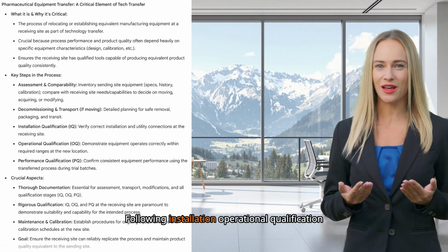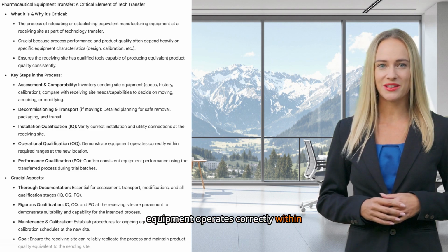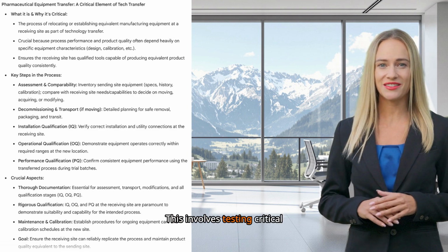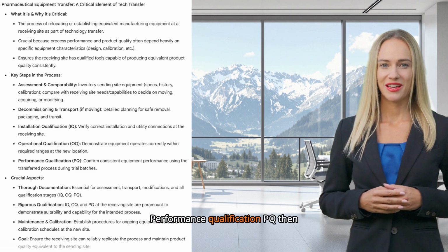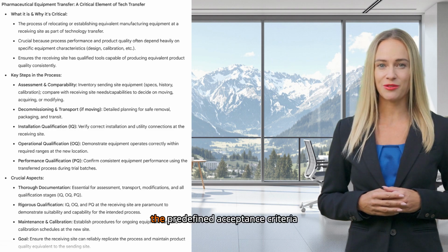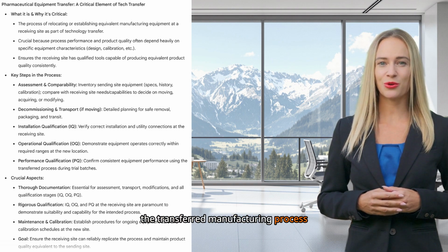Following installation, operational qualification, OQ, is crucial to demonstrate that the transferred equipment operates correctly within the established operating ranges at the new site. This involves testing critical functions and parameters, often mirroring the OQ performed at the sending site. Performance qualification, PQ, then confirms that the equipment consistently performs according to the predefined acceptance criteria during trial batches at the receiving site using the transferred manufacturing process.